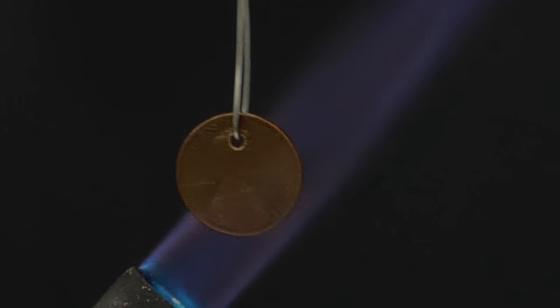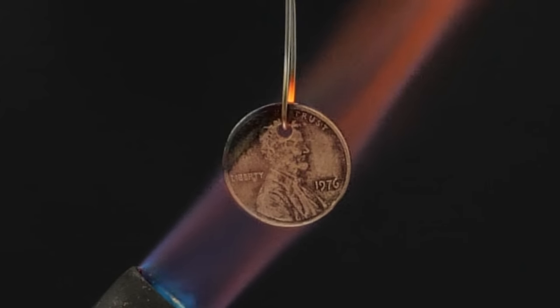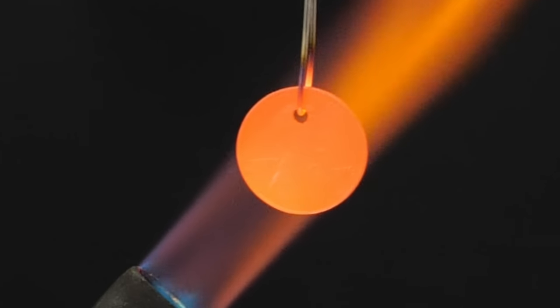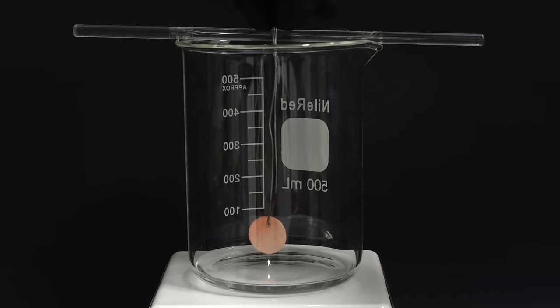All I need to do is get a blowtorch and heat it up until it's red hot. Then, I can lower it into the beaker and hold it just slightly above the acetone.